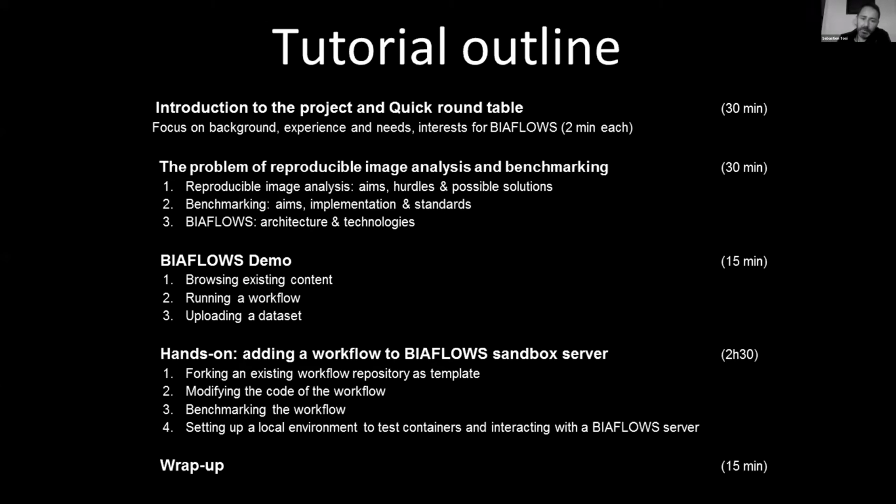This is the longest section of the tutorial, where you will actually have to do things yourself and add your own workflow to one of the BIAflows instances, what we call the sandbox server that is open for this, and then benchmark your own workflow on the platform, etc. And then finally we will have a wrap up with maybe some more questions or generic discussion.